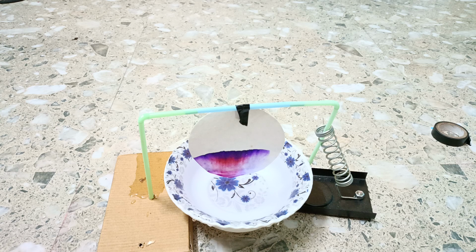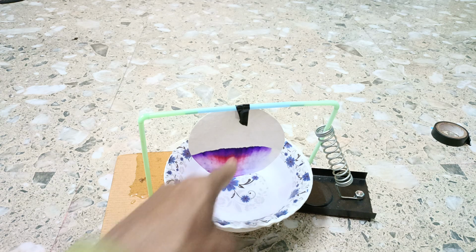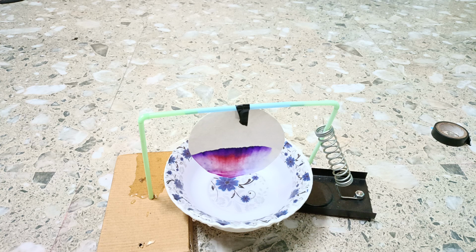It will take some time, but you can see how it is separating the two colors. One is red and the other color is blue. And this is what we call paper chromatography. It is an inexpensive method of separating dissolved chemical substances by their different migration rates across sheets of paper. That is, it depends on the migration rates from one point to the other. And you can see very clearly that here you get the red color and here you get the blue color. In this way, we can separate the blue color and red color in a very efficient way. And this experiment is known as paper chromatography.